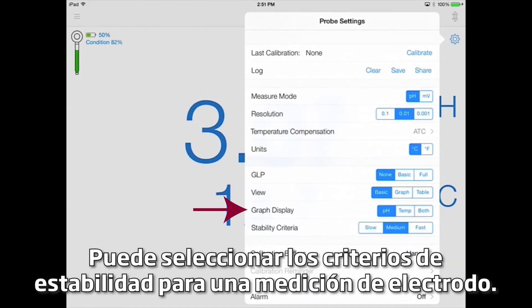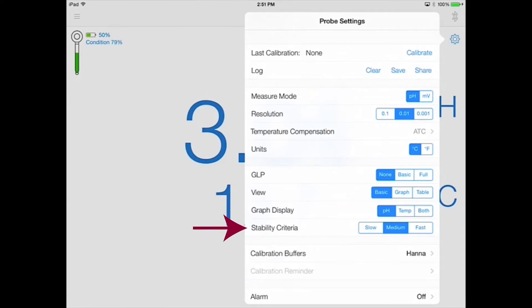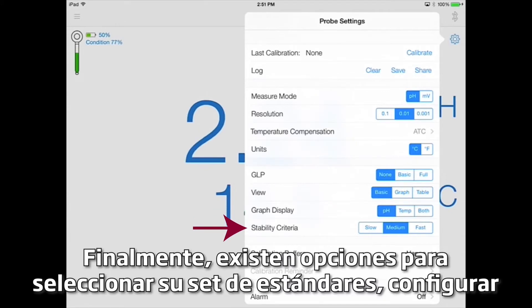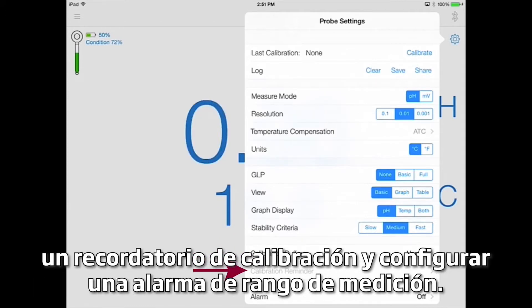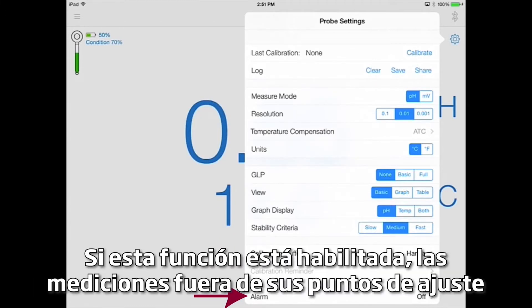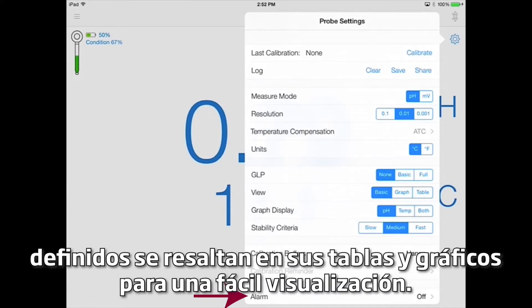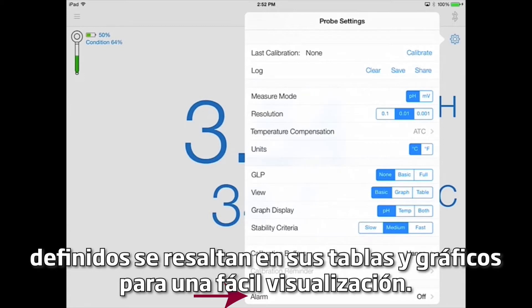You can select the stability criteria for an electrode measurement. Finally, there are options for selecting your buffer set, setting a calibration reminder, and setting a measurement range alarm. If this feature is enabled, measurements outside of your defined set points are highlighted on your tables and graphs for easy viewing.